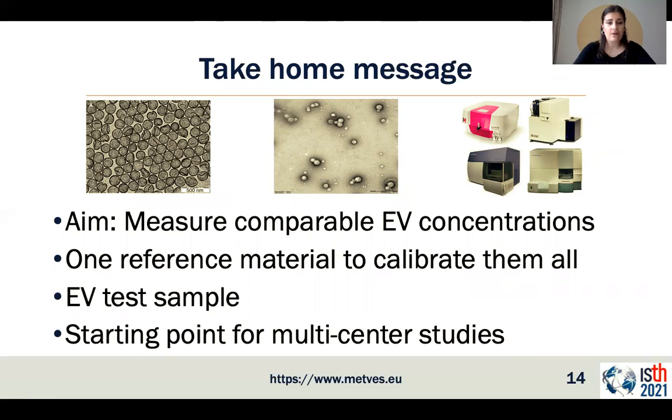So to measure comparable EV concentrations by developing one reference material to calibrate them all, and by developing a ready-to-use EV test sample from different body fluids. And this will actually be the starting point for multi-center studies, which we really need if we want to bring EVs to the clinics in the long run.